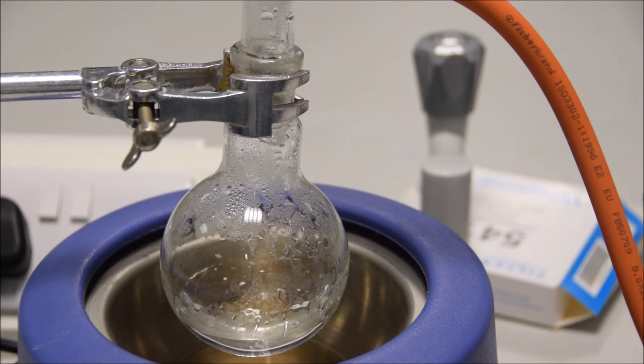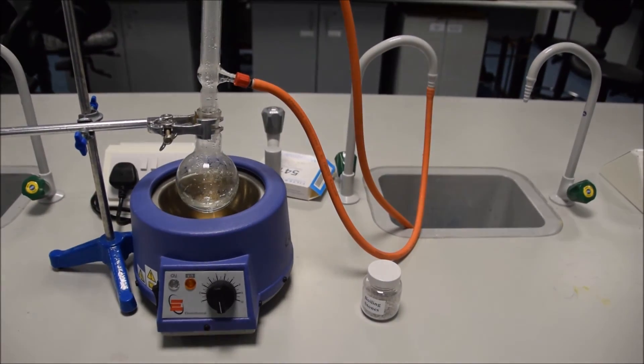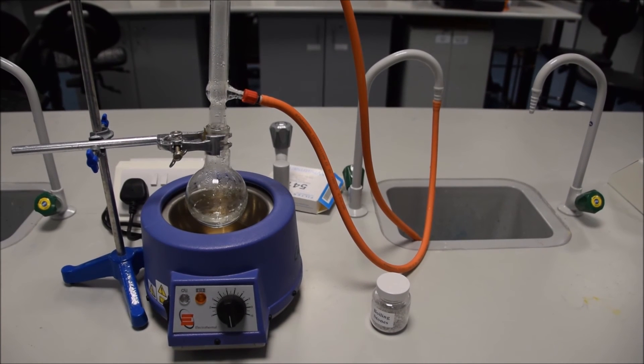Again, you can see, if you look closely, as our flask cools down, eventually evaporation stops, and the condenser stops dripping liquid down into the flask. You can also see the bumping granules are down in the bottom of that flask. They're essential. Don't forget them.